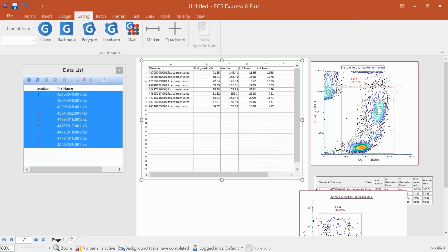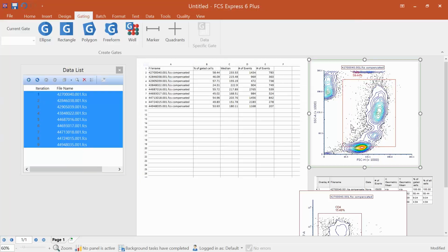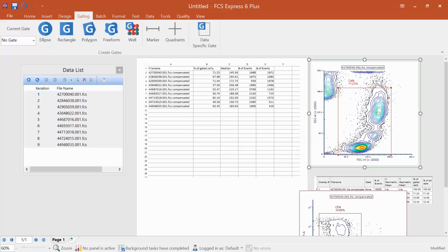And again, we have a lot going on now, but as we adjust this gate, they'll update for us in real time. Now, the next thing that comes up with this is how do we use formulas to help analyze this data? Because this is probably what you're going to be doing in Excel. You'd be taking data like this, but doing some sort of average or median, or finding the min or max of a data set to show you what has responded.